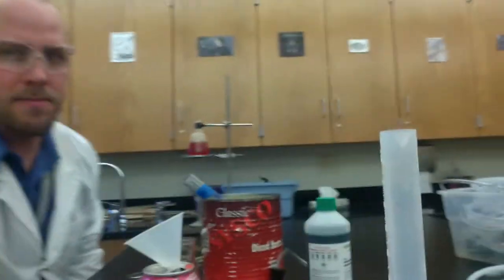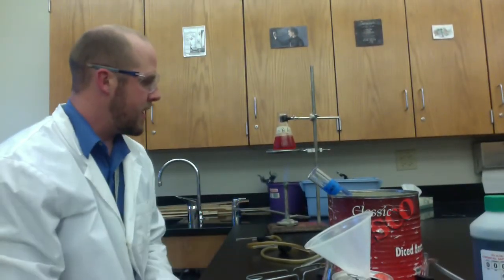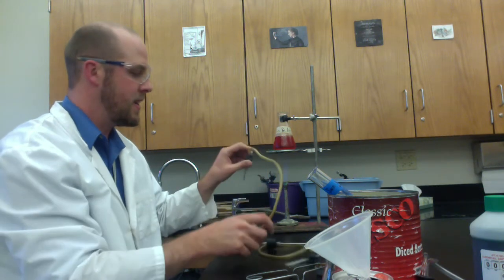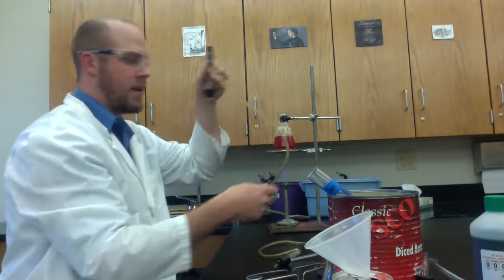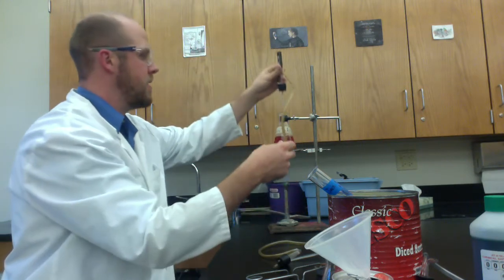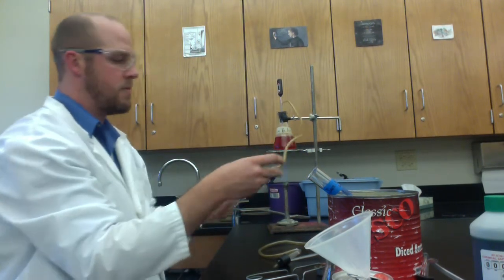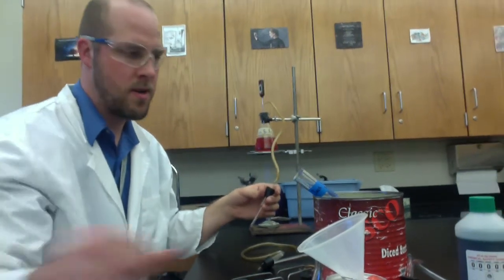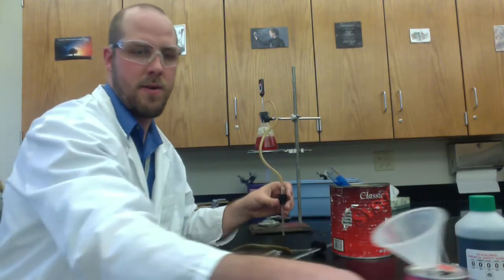So I just lit my Bunsen burner over here. You want to get your flame so that it's maybe kind of close to that Erlenmeyer flask. You don't want it actually enveloping and going around the Erlenmeyer flask. So while that's working, I'm going to hook up my thermometer and my tubing here.